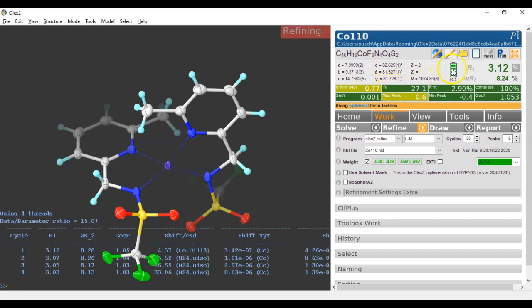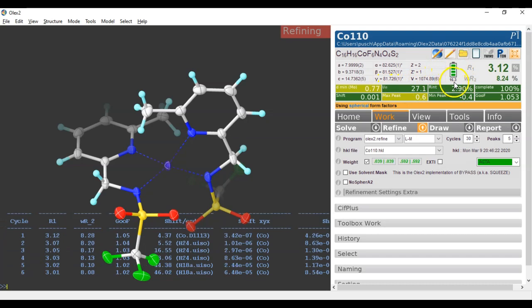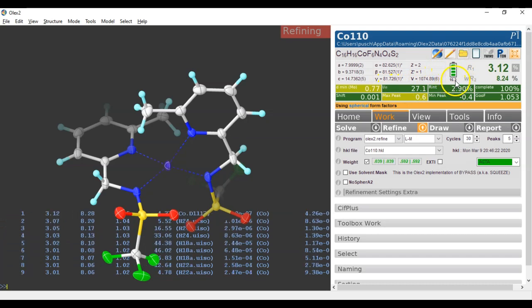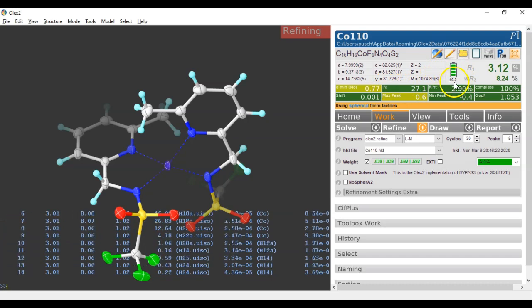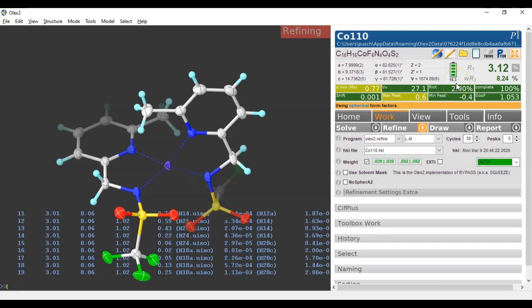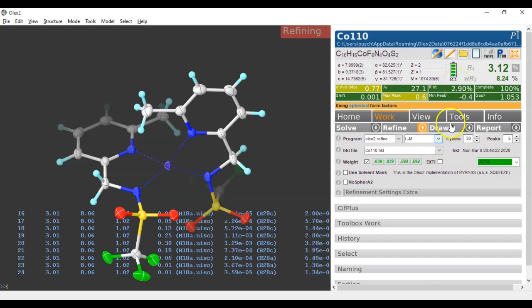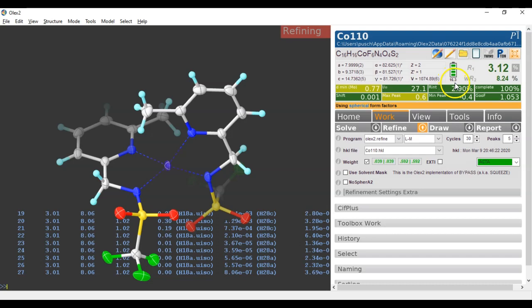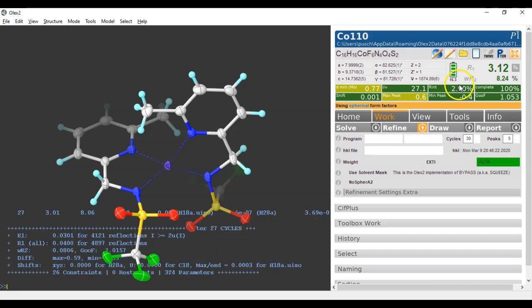Now we use 16.3, so the data-to-parameter ratio was 16.3. Now we are going to use a lot more parameters, so this ratio is going to decrease. So you need good data. You need a lot of data for this to work.